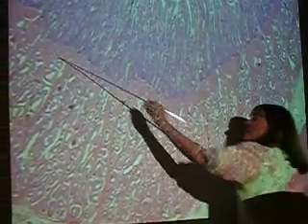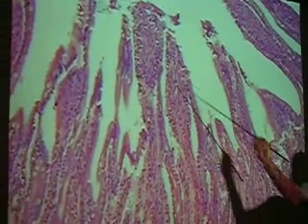If you see a little pink layer, guys, that's muscularis mucosae. And then, what are all these pointed things here? Papilla. No, villi. Good, villi. Yeah, in the duodenum, they're called villi. In the center of each one is lamina propria. And I'm not sure if I can get you some good epithelium here.